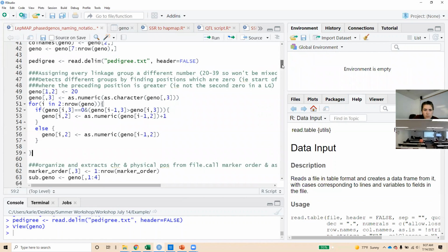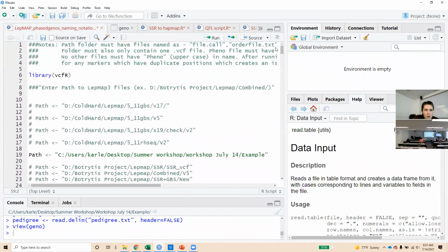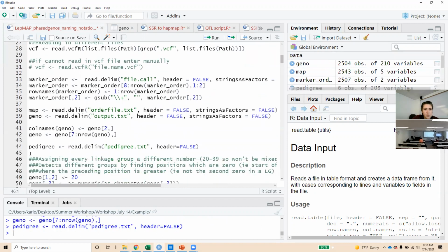So the 20, what that exactly means? So you mean a chromosome, they are 20? Just 1 second. Okay.